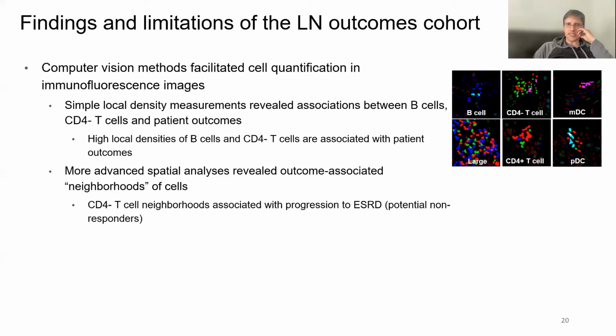The Mask R-CNN, you adapted that for this application, is that right? Correct, yes. Did you invent that? No, this was something that came out of Google in 2016 or 2017. But it's shown to be the state of the art for instance segmentation in natural images. Deep learning moves really fast, and it's still pretty much state of the art. There are a few other instance segmentation algorithms that have popped up. Some might have fewer parameters than Mask R-CNN. Others might be a little bit faster, but in general, Mask R-CNN still produces the best performance.